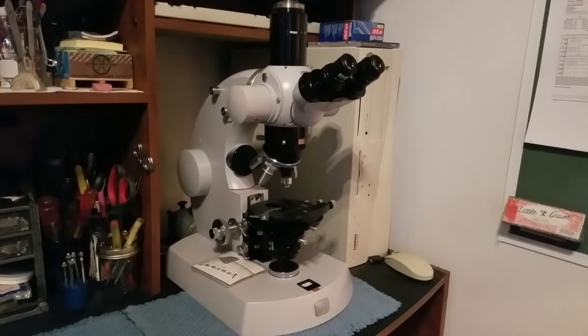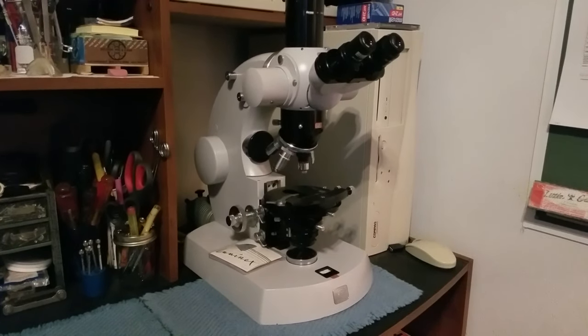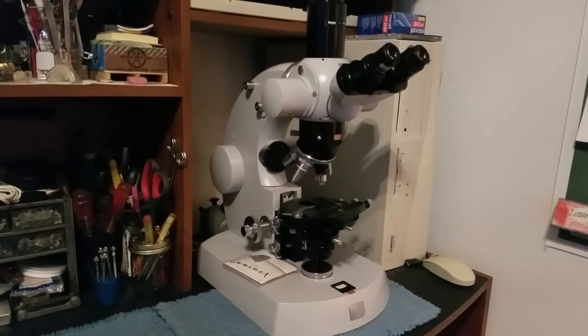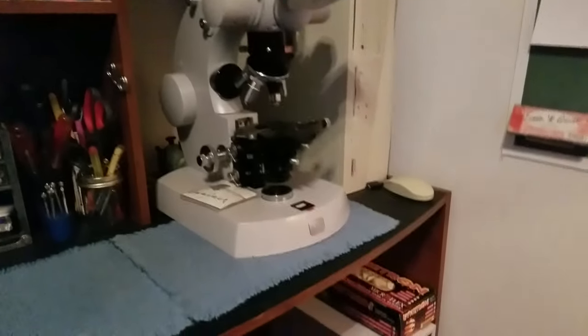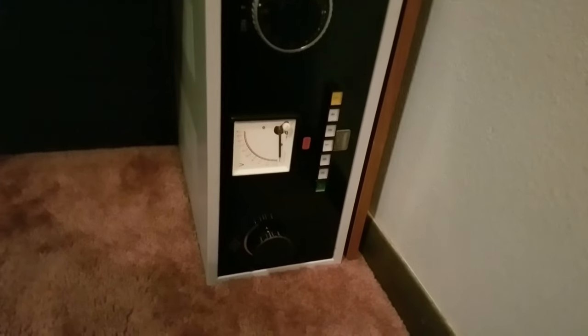I didn't have it when I got the microscope, so I kind of gave up hope — but I figured they had to have it somewhere. Well, about a day ago I got it! It's amazing and it's in extremely good shape.